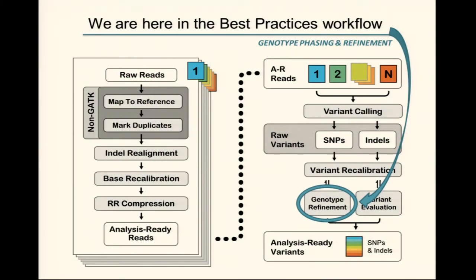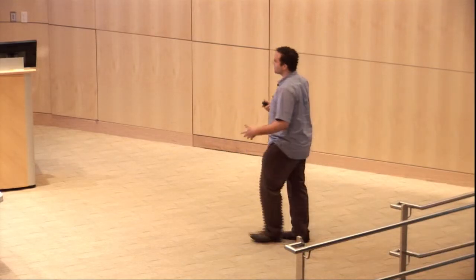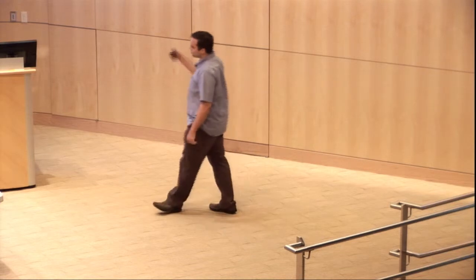Of these branches, it's the one which is the most different from the rest of the workflow, in the sense that it leverages expertise from outside of the group, and we provide inputs into other tools and allow you to bring those outputs back into your VCF.